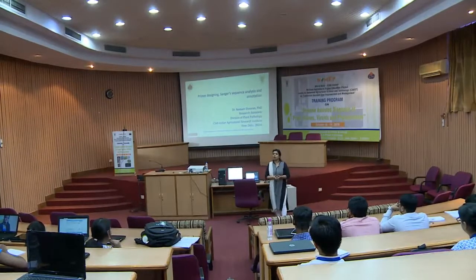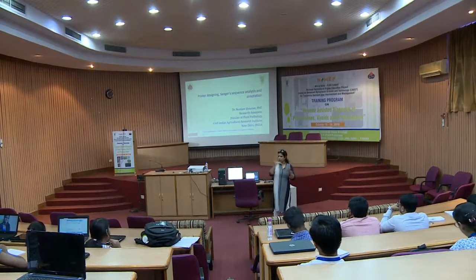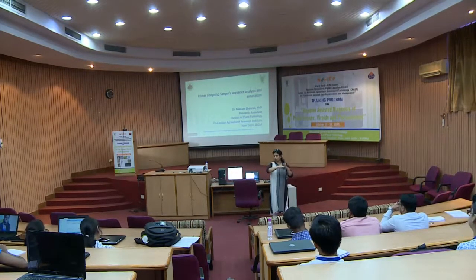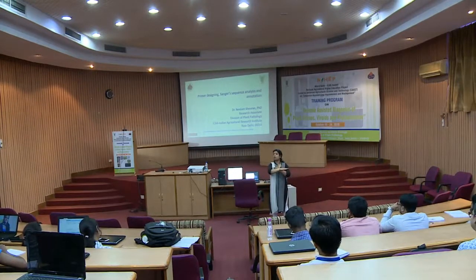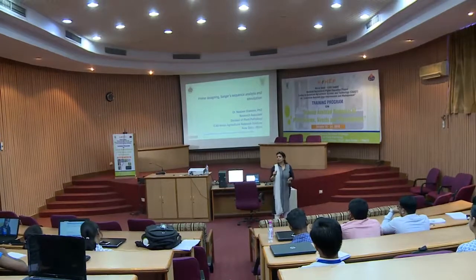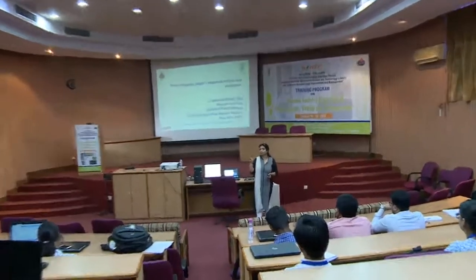Now, we have 2 primers, one is the forward primer. Let us suppose this is the whole sequence, one is towards the forward and one is towards the reverse, right. So for each gene you will be designing 2 primers, the forward primer and the reverse primer, both around 18 to 20 bases each. Okay.